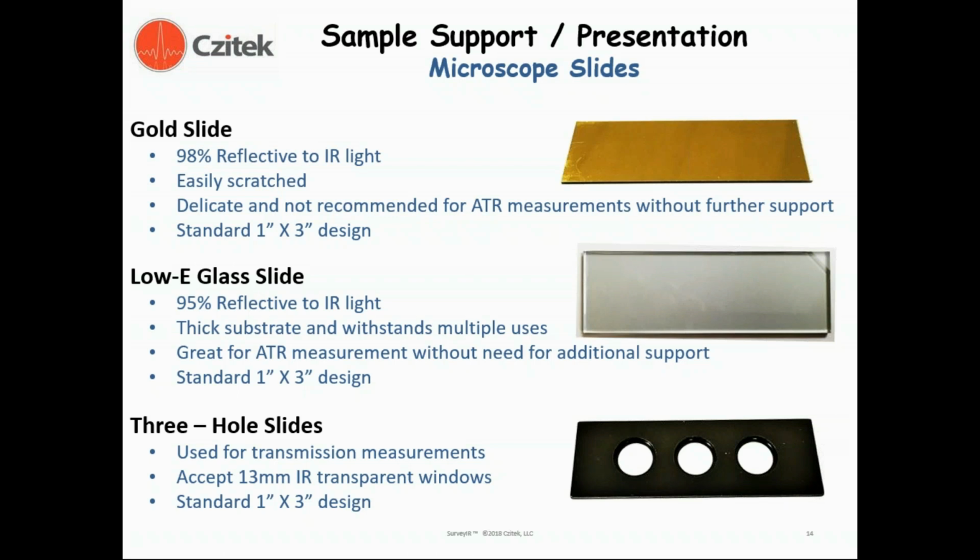We also can put transmitted light substrates, whether infrared crystals or diamond windows, into 3-hole slide mounts. These accept the 13-millimeter diameter infrared transparent windows.